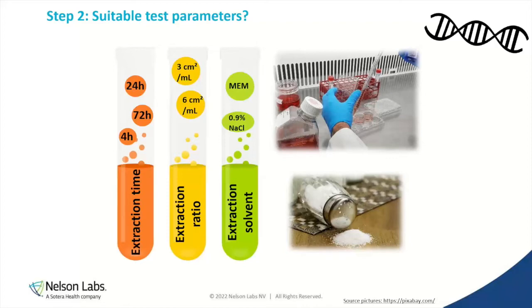Exactly. So another parameter we want to talk about is the extraction solvent. So far we've only talked about extracting in MEM fluid, but there is an option to use 0.9% saline. There are other alternates, but really MEM solution is used, usually supplemented with calf serum or not, and then the saline. It's nice to think about if your device is only ever exposed to saline, like an IV bag, which we're talking about a lot today, and it doesn't make sense to extract it in something else, especially if we had seen a failure before, but it's only ever exposed to saline. Let's use an appropriate clinical solvent there.